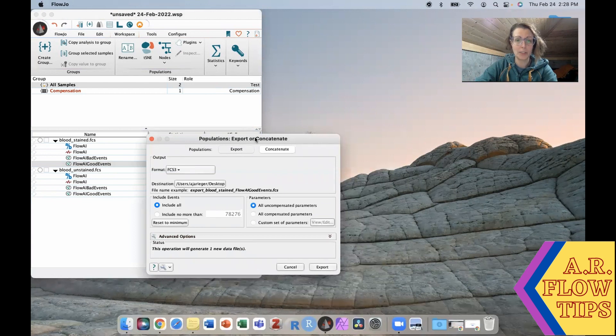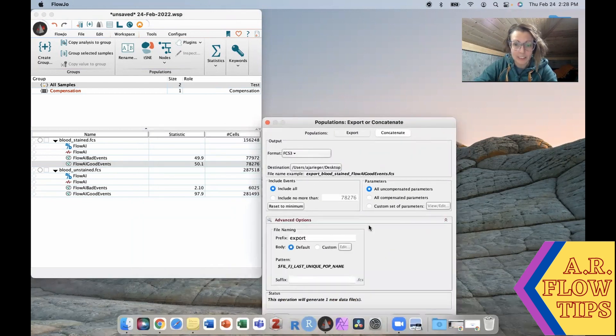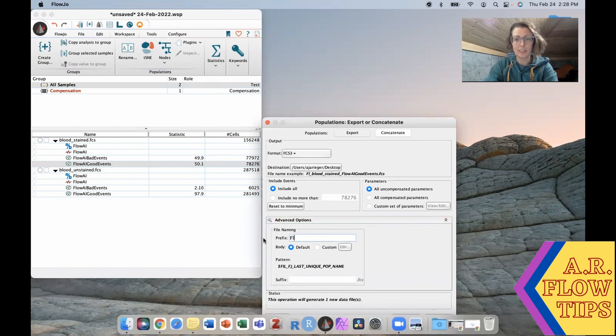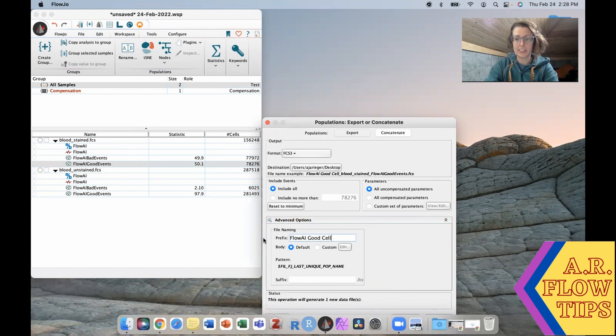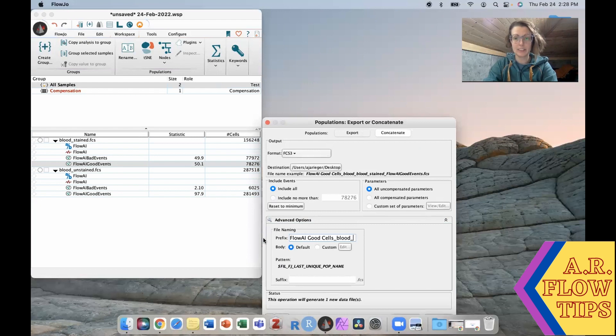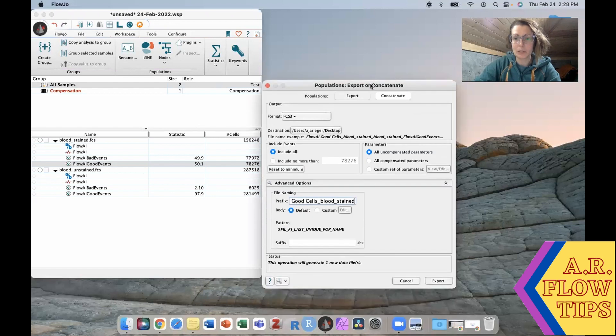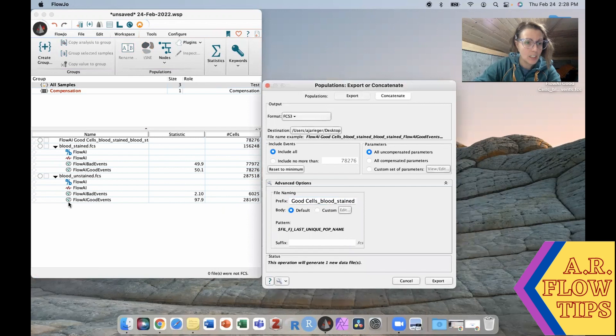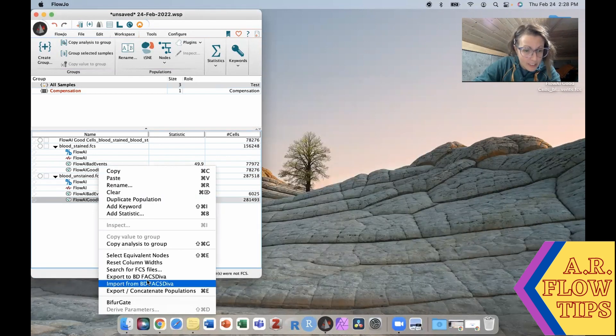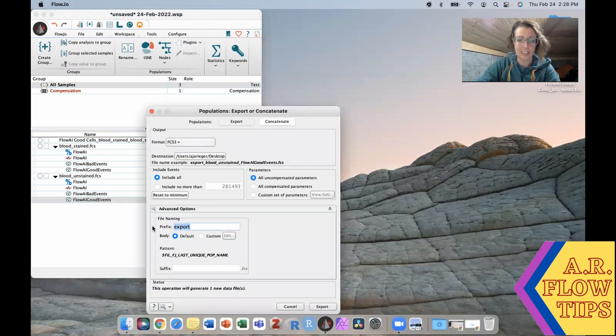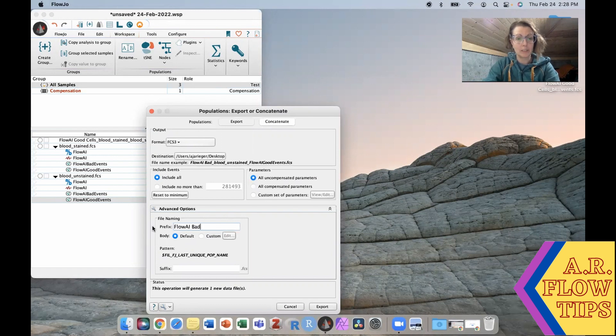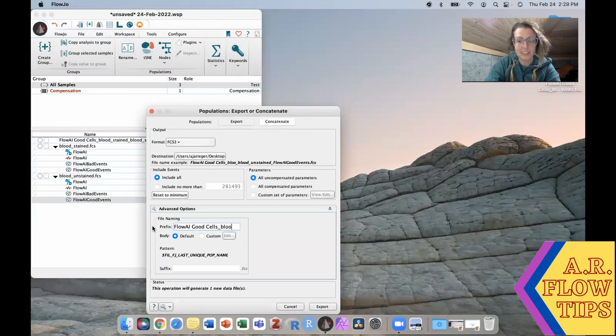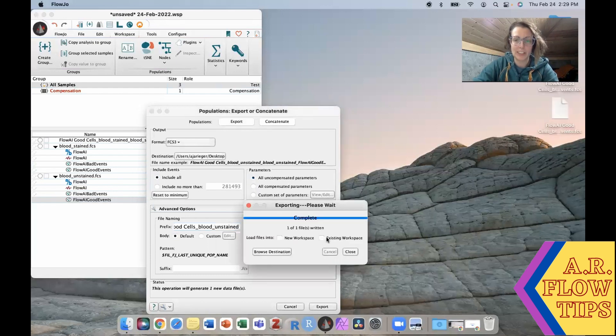So I want to export this onto the desktop and we'll go ahead and export that onto our desktop or even just into our existing workspace. Then we'll do the same thing with this guy here. So take our Flow AI good events and export populations, and then this would be our Flow AI bad cells, export that population as well.